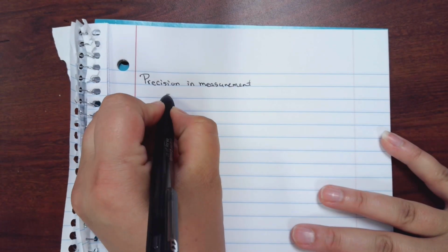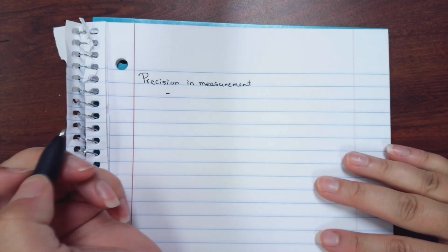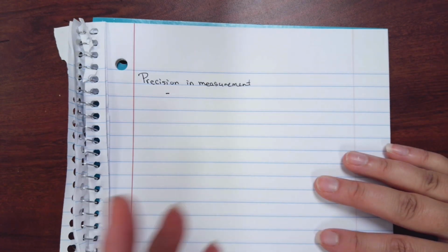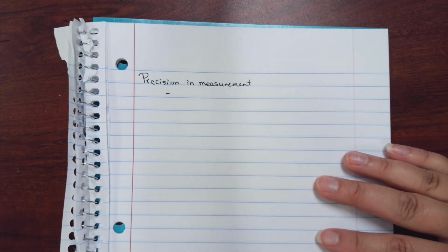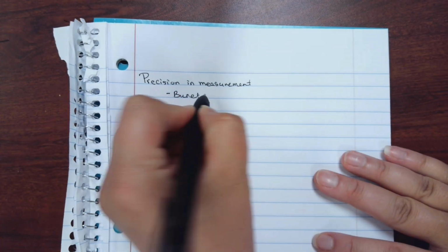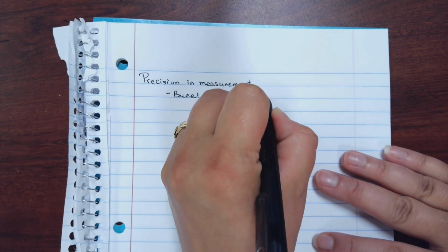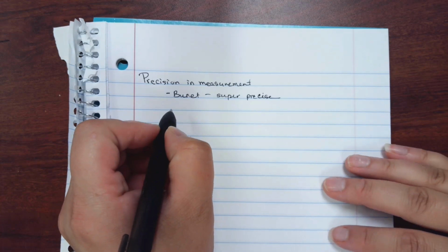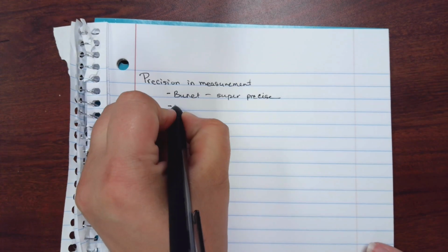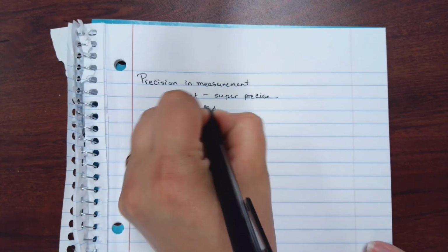So for example, if I'm measuring out acid for a titration, titrations have to be exactly perfect. Like 1 drop is the difference between the answer and past the answer. So if we need something to be super precise, I'm going to use a burette. Okay? But for most of our everyday things, we don't need to be that precise, but we do want to be fairly precise. So our sort of middle of the road precision is a graduated cylinder.